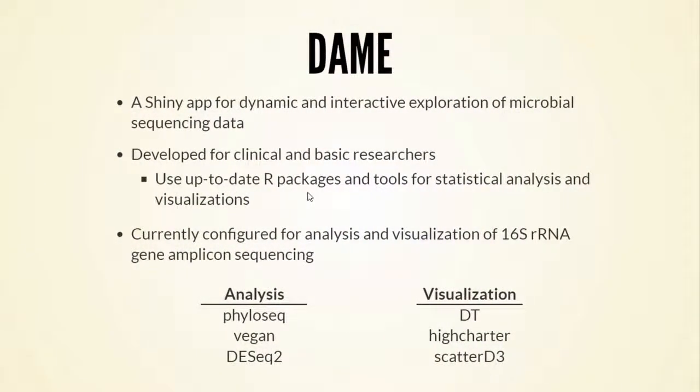We built this Shiny app, of course it's Shiny, so it's dynamic and interactive, but we really wanted to explore microbial sequencing data. We're at a children's hospital in Little Rock, and we're also part of the Department of Pediatrics at a medical school, so we deal with a lot of clinician scientists who don't have a lot of working knowledge of R, but want to use the most up-to-date tools for analyses and visualization of microbial data.